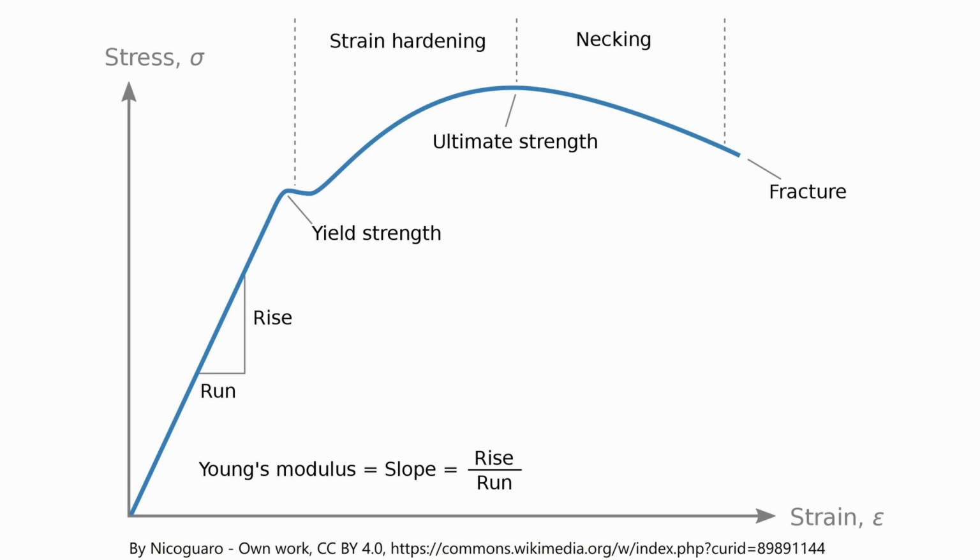The reason we are carrying out this tensile test today is to determine the maximum load the material can withstand, the percentage reduction in cross-sectional area, and the failure type. A ductile material will show significant necking and a reduction in cross-sectional area, while a brittle material will break with very little plastic deformation perpendicular to the applied load.